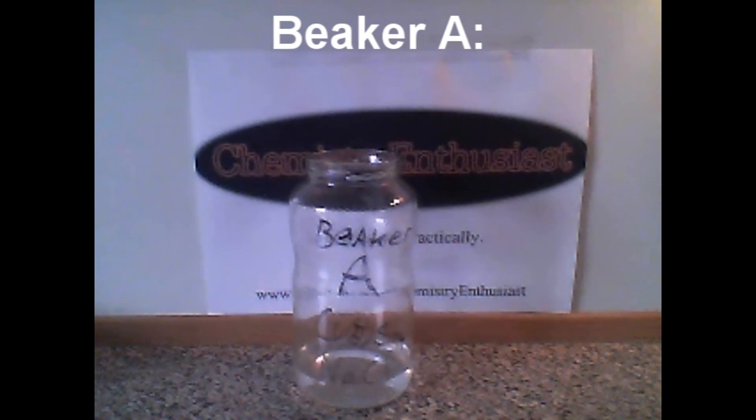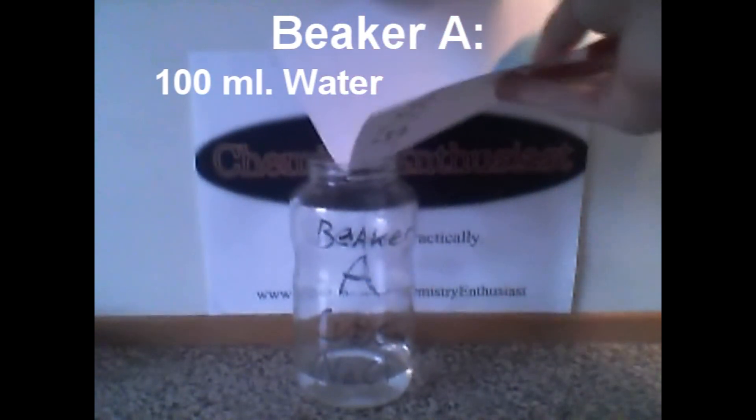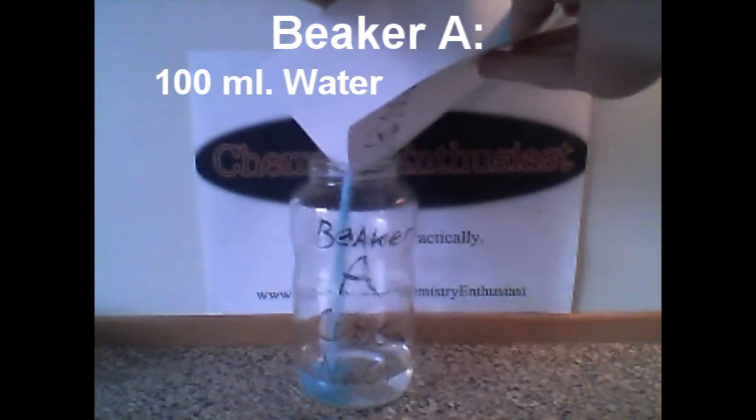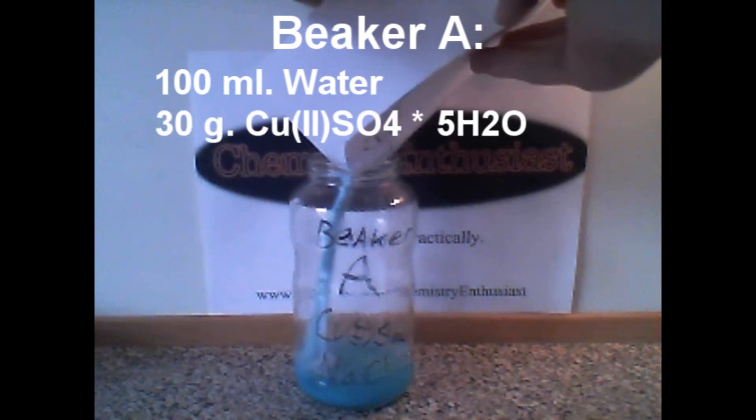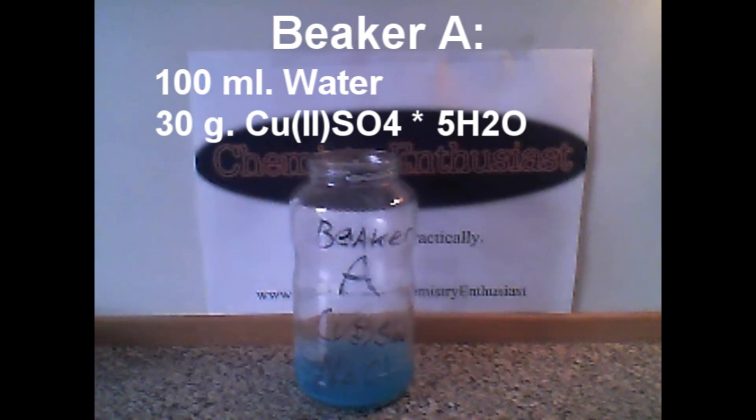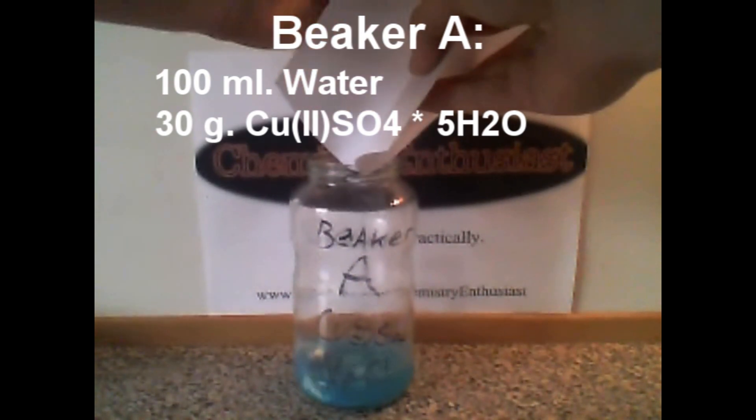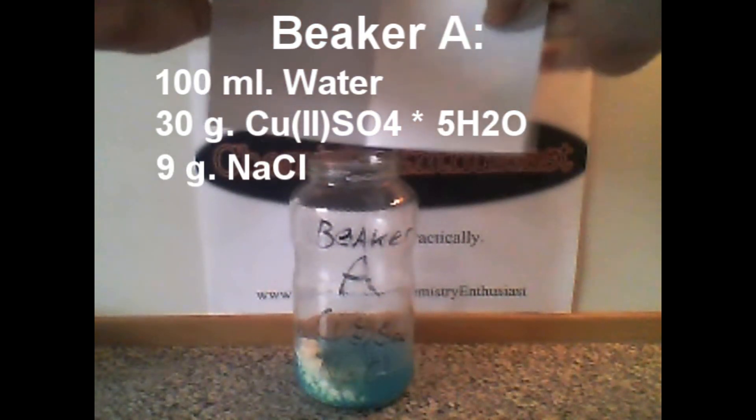In a beaker labeled A, pour 100 ml of water, 30 g of copper sulfate pentahydrate, and also pour in 9 g of sodium chloride.